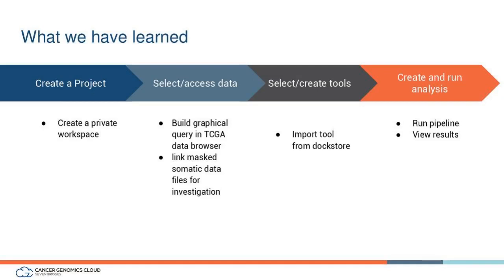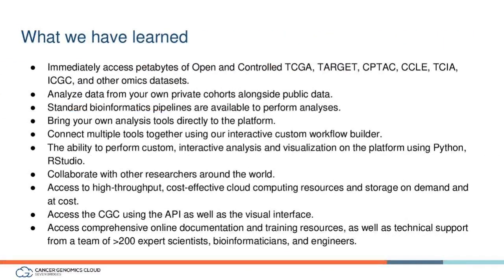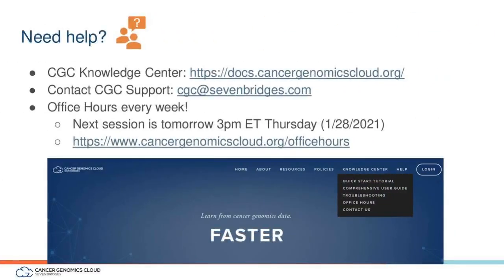We found TCGA open data, we imported a tool, and we ran a pipeline. And really, there's a lot of stuff that we've demonstrated, including connecting multiple tools together.